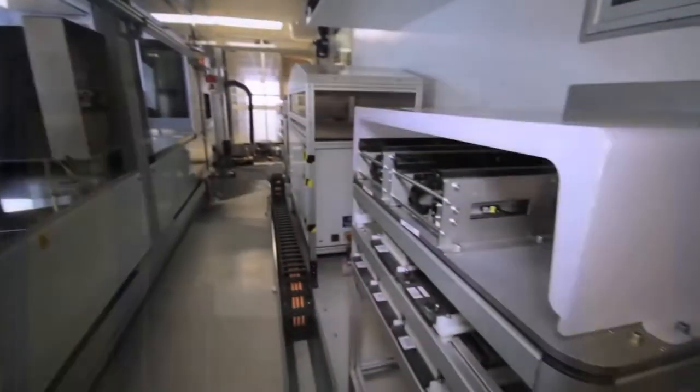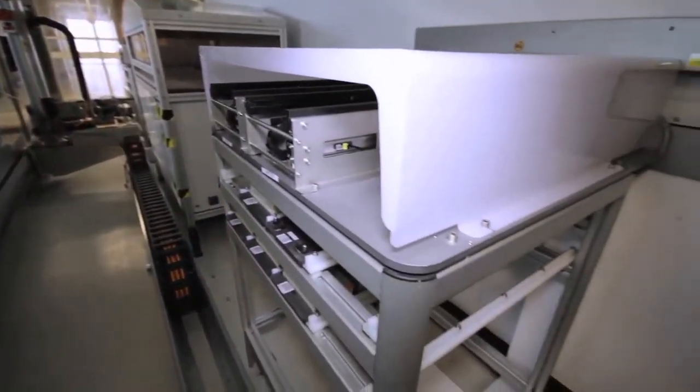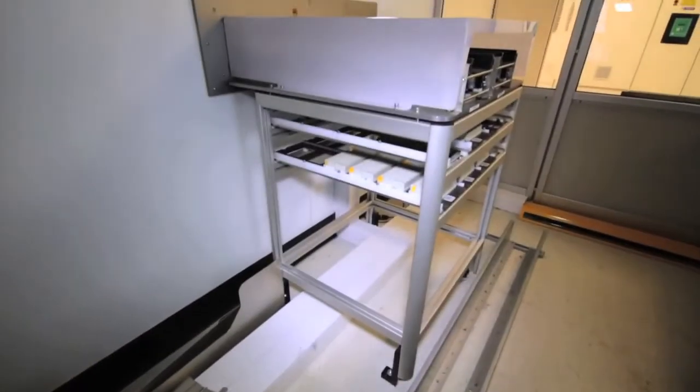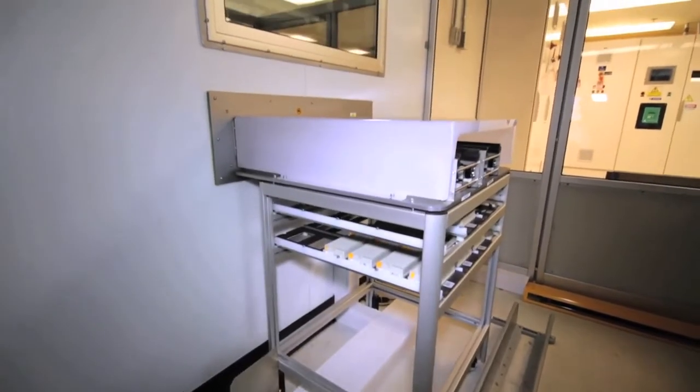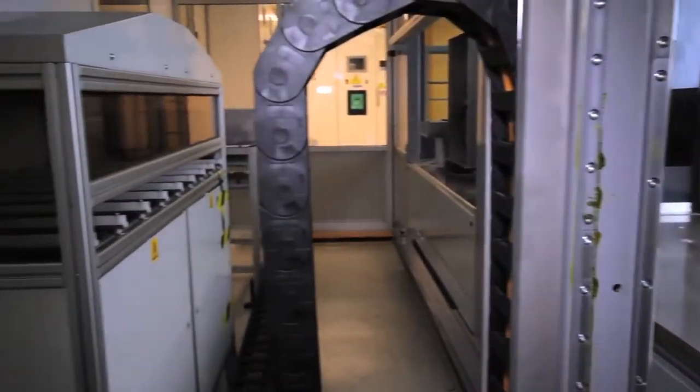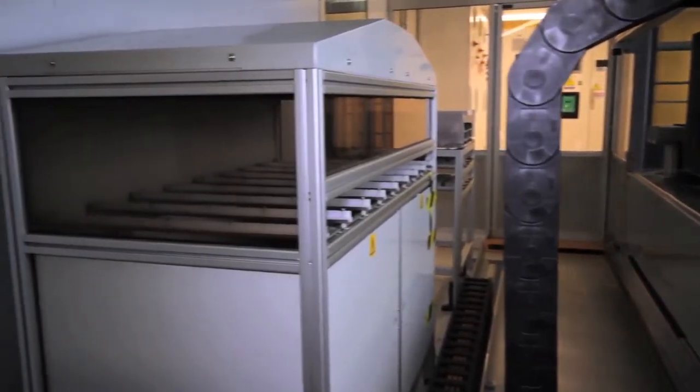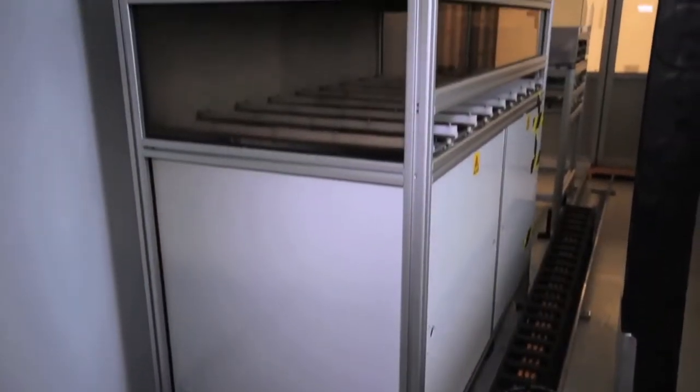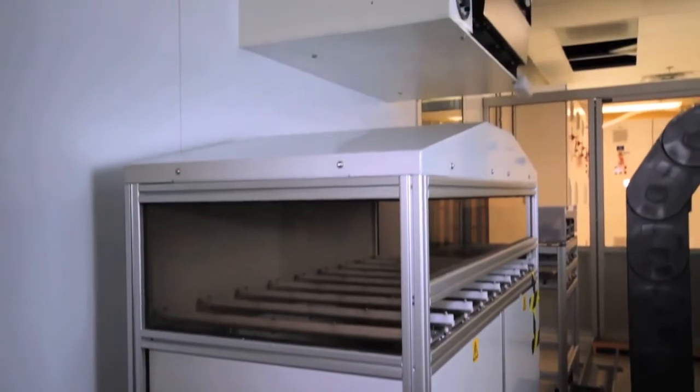Tube buffer stations help manage the flow of loaded tubes and microplates, awaiting transfer into or out of the storage freezer. The 35 degrees Celsius sample thaw cabinet returns frozen samples to ambient temperature within two hours, featuring built-in buffering lanes for additional waiting plates.